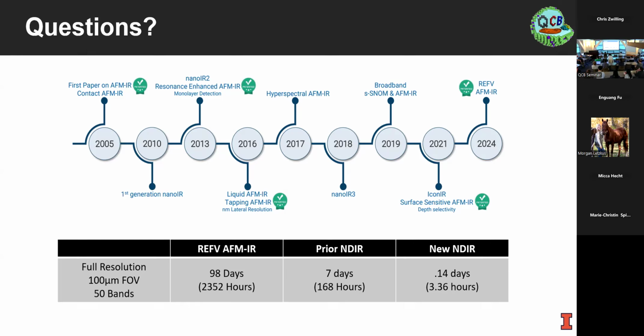You can do nothing else at all, right? So I think the one aspect is to really push this instrumentation down, carefully controlling and understanding each step of the way, down to perhaps, I challenge Seth, 5 nanometer things, because you can get AFM tips now that are just a few nanometers down. So again, that's a question, how quickly we can get there. So that's one aspect, and this is perhaps the most critical aspect of the whole work.